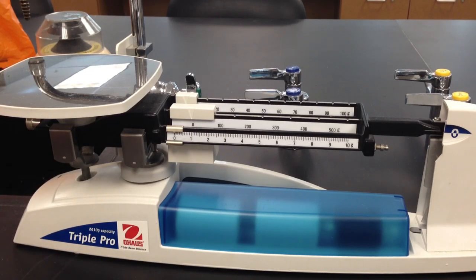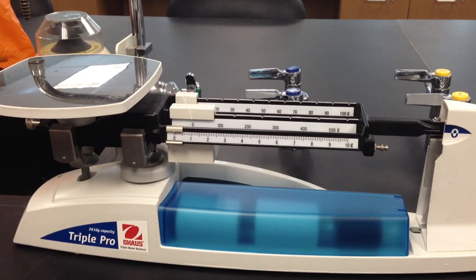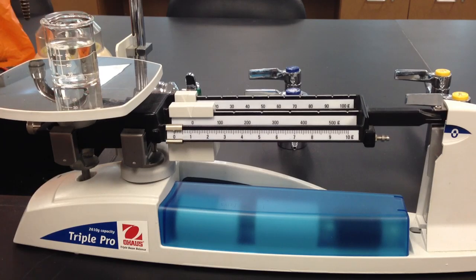How to read a triple beam balance scale. The first thing you want to do is make sure your scale is zeroed properly. We look down here and our scale is right on the zero mark, so we're ready to use it. We're going to measure the mass of a beaker with some liquid in it.